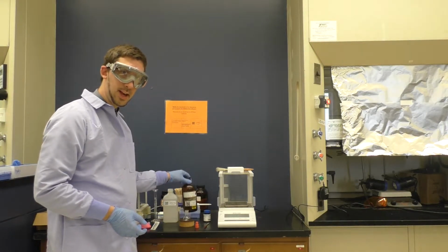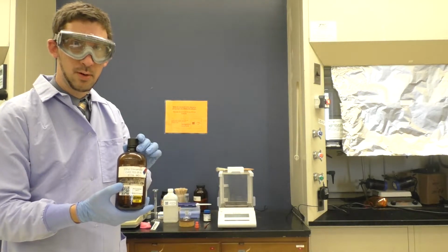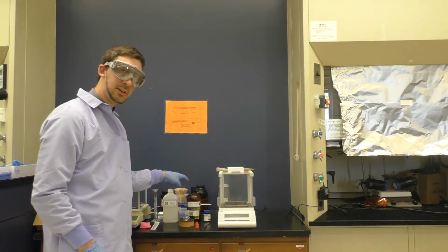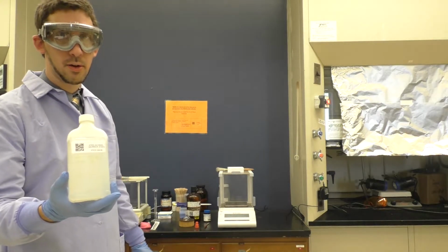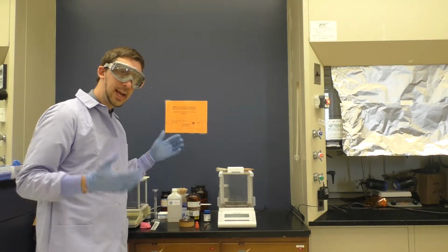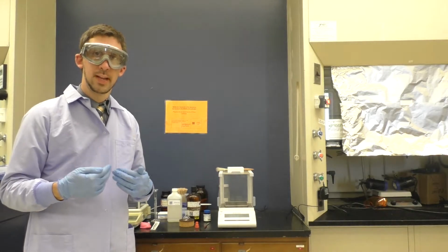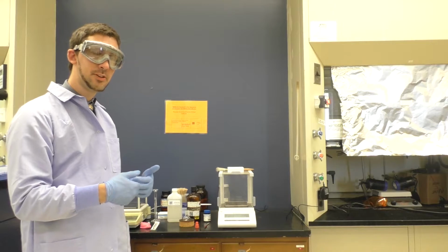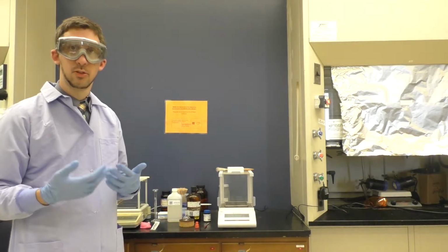I've then got the actual substrate, the ethyl cinnamate, primarily the trans form. So ethyl cinnamate. And then my solvent for the reaction is simply ethyl alcohol or ethanol. Now, whenever you go to set up a reaction, most of the time it's usual and helpful to weigh out your solid materials and add those to the reaction flask first. Then follow that with your liquid materials and solvent.